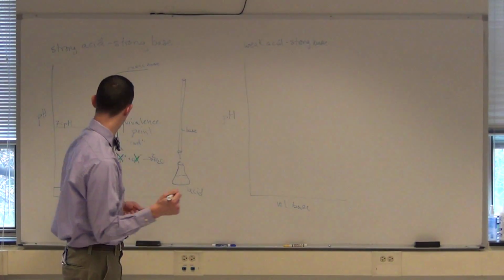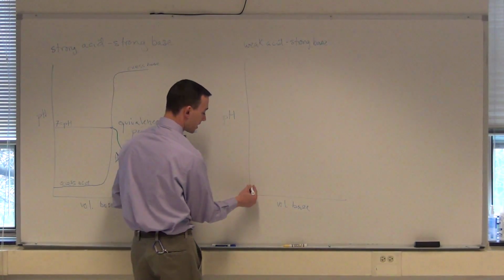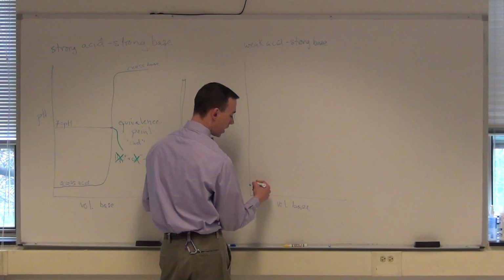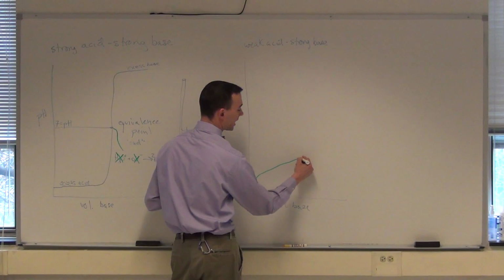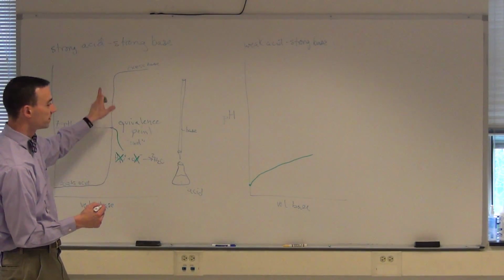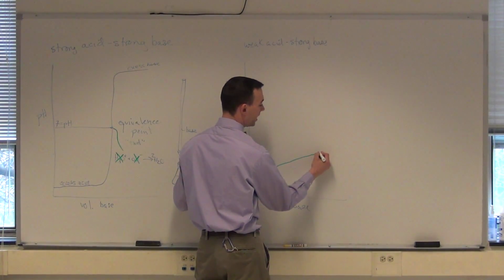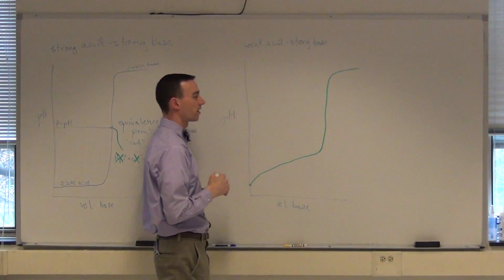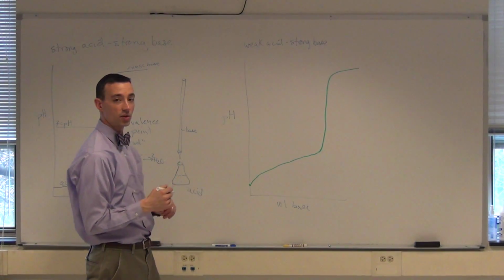We'll have extra acid at the start, but now our pH will not stay rock solid low like it did before. It will rise steadily, but not rapidly like it does here, for a short period of time. Then we will reach a point when it does rise rapidly, and we end up with our excess base, just like we did in the original case.